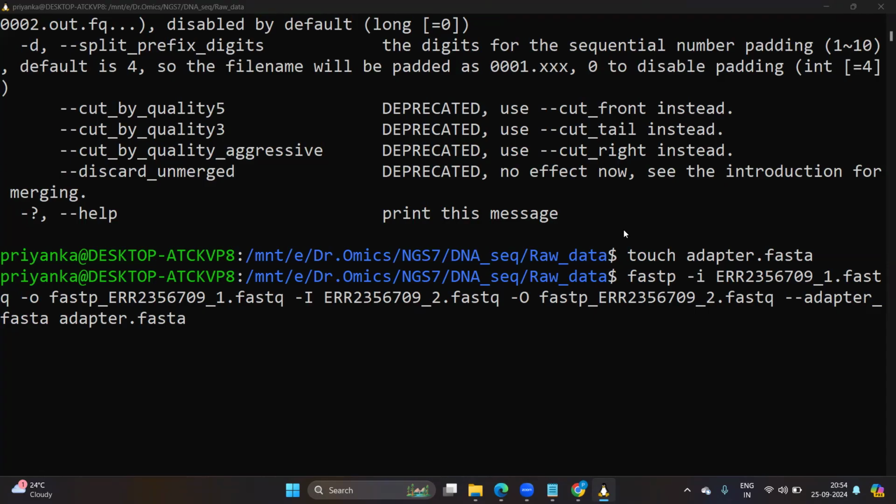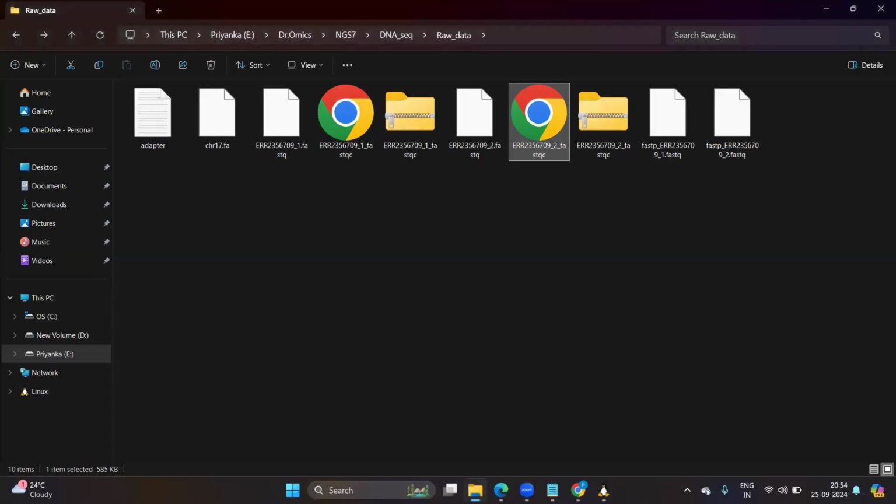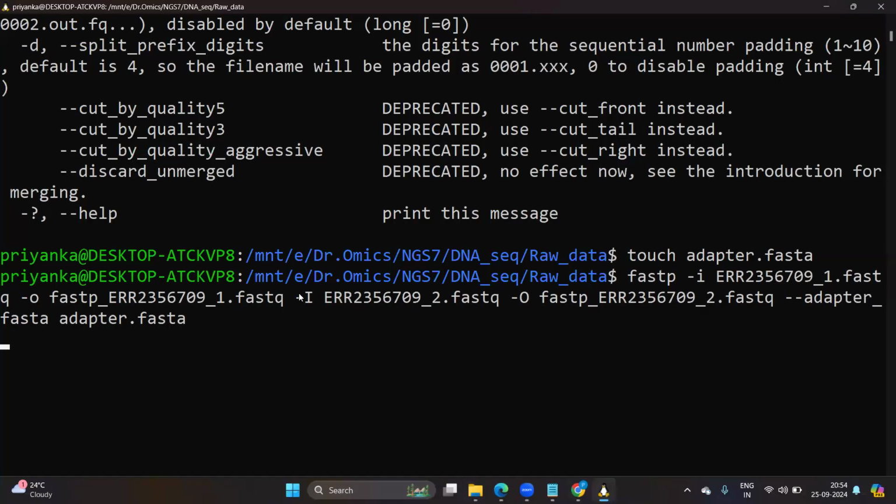And do not make any spelling mistakes in your command. Otherwise, it will throw the error again. Let it run, it will take some time. Okay, I'm waiting for your doubts in the chat box.